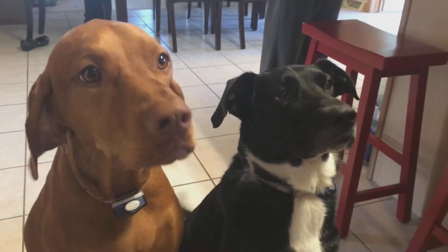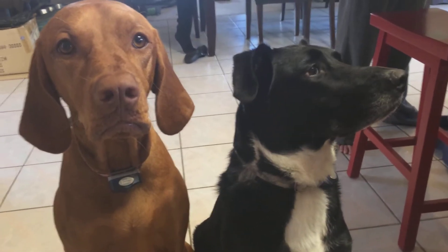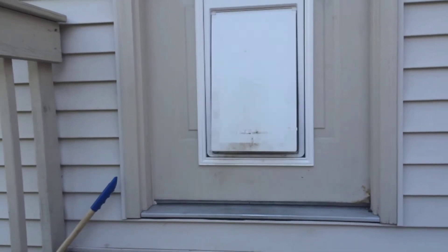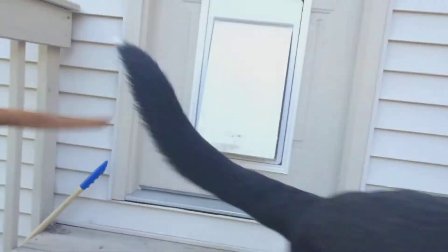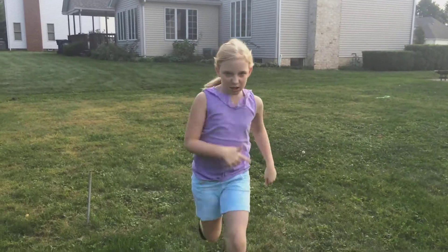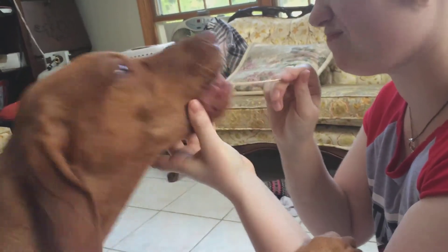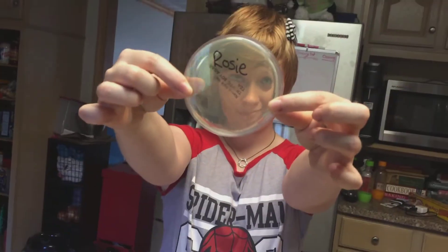What else do you want to swab? Gently and carefully swab the inside of your pet's cheek, or the top of their tongue. Just to be safe, let an adult do this round. Again, don't forget to label. Wipe the swab against the plate and set it next to your other experiment.